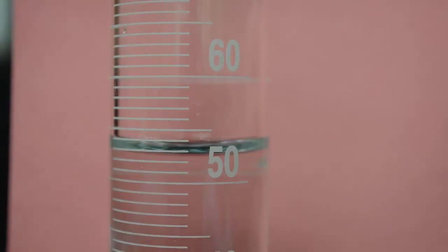And then finally I have to guess that last spot. It looks like it's just below 53. So I would read this as 52.8, 52.9. Either of those readings would be fine, and of course we would tack a unit on, milliliters. So 52.8 milliliters, and that's the reading.